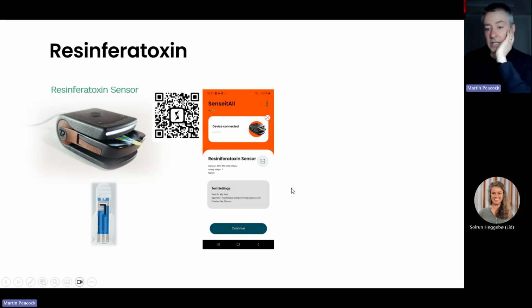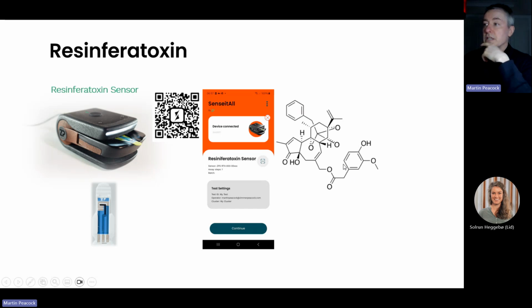You'll see the fact that we actually drive this device using a smartphone app. The smartphone's great because it both makes Bluetooth with the hardware, and it also forms a conduit on the Wi-Fi to a cloud system where we save all the data.